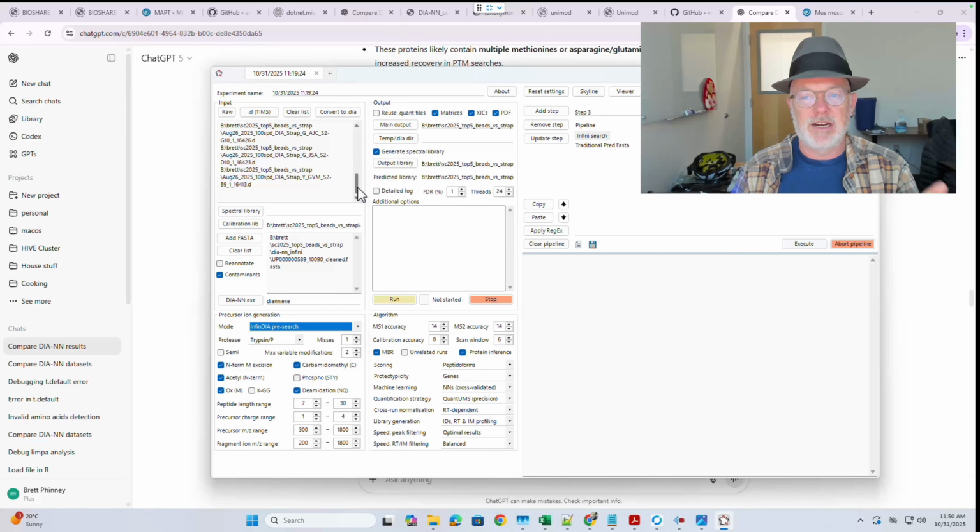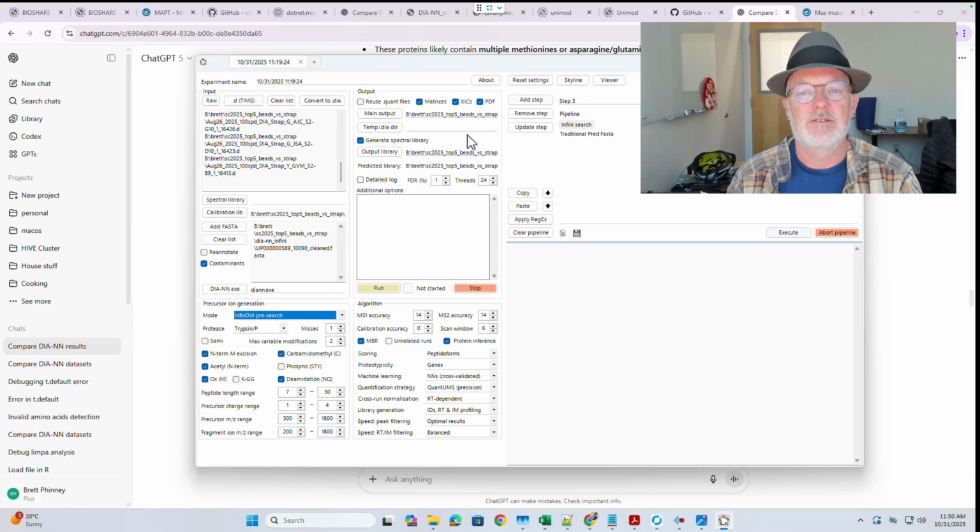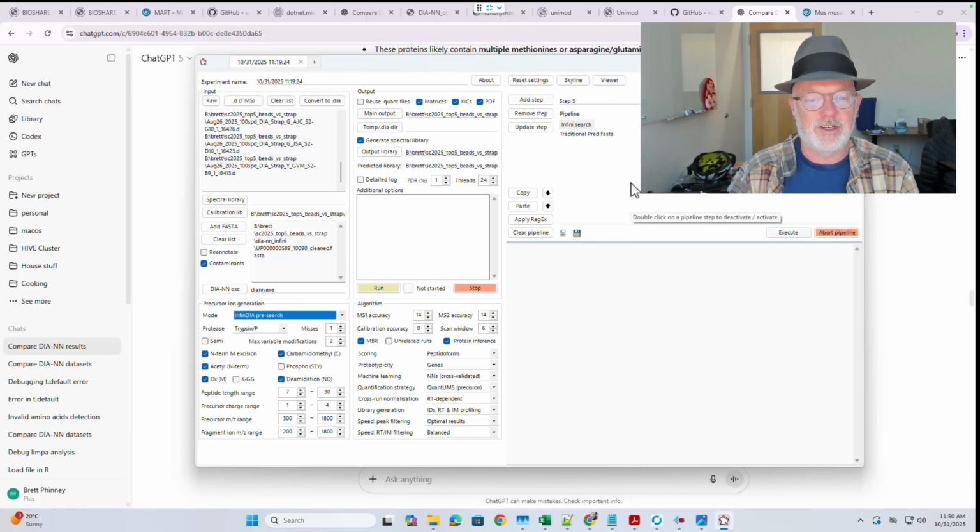You can put the Parquet file right into Limpa. I can put all of this data on the BioShare for you with the Limpa code to do it. So that's it. I didn't test Skyline, and I didn't look at the XICs because I searched it earlier and closed the window. But it should work just the same as the last time. You generate a Skyline file. You can view these in Skyline.